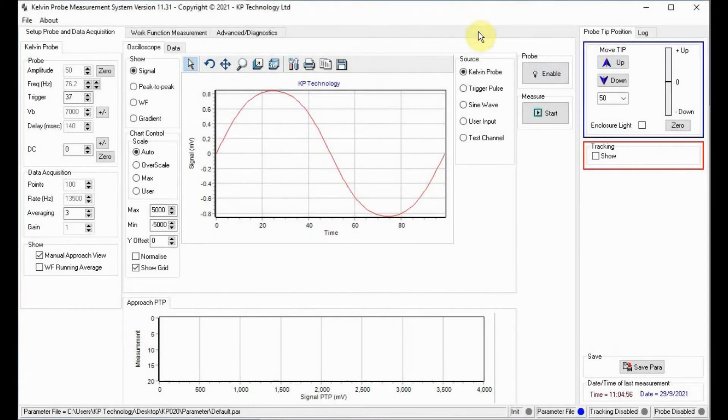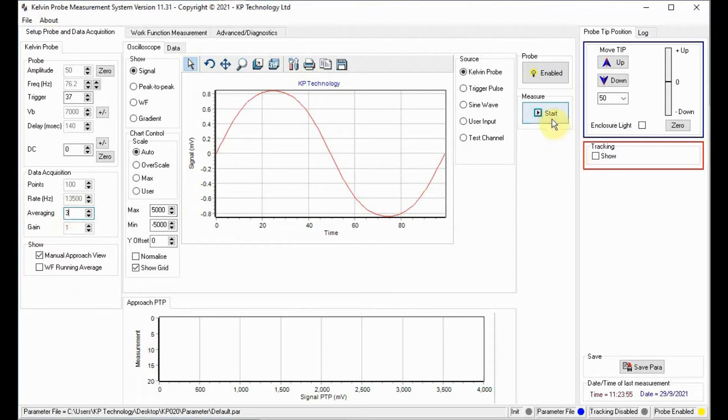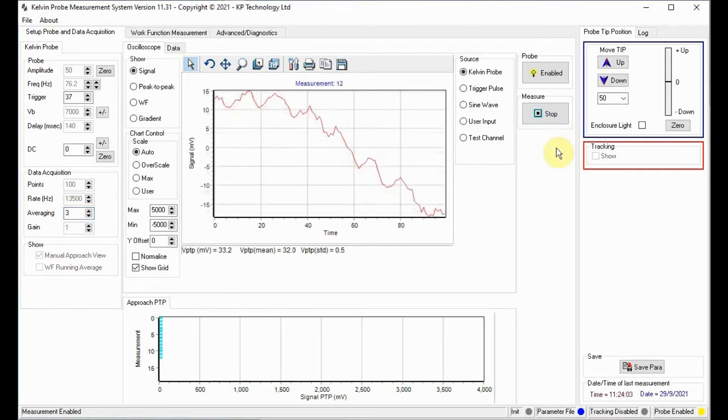In the setup tab click enable to start the probe vibrating. Now set the averaging value to 3. Finally we can press start to start measuring the Kelvin probe signal.